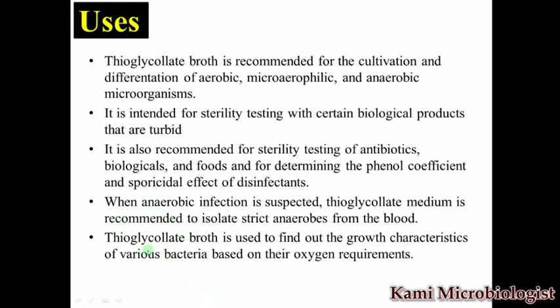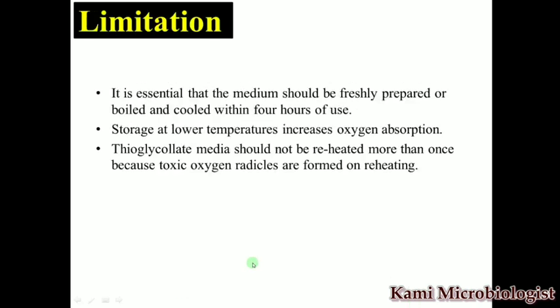Next, this type of media is also needed when an anaerobic infection is suspected, so the thioglycollate medium is recommended to isolate the strict anaerobes from the blood. This type of media is also important to find out the growth characteristics of various bacteria based on their oxygen requirement. So these are the simple uses of the media.